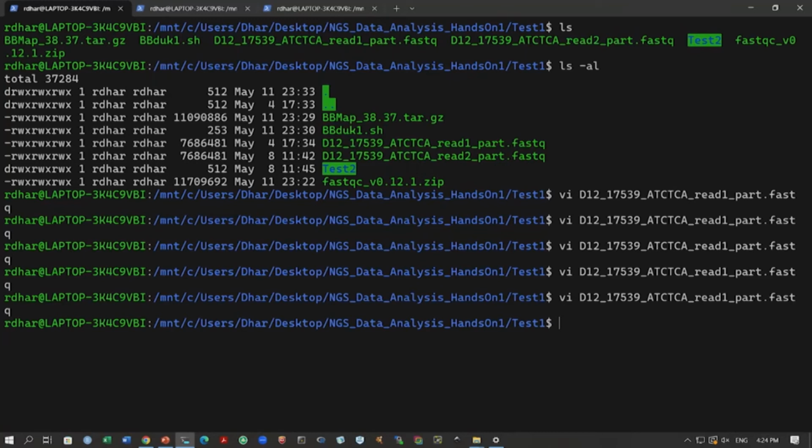So, that gives you a brief overview. Now the next agenda is to look at the quality of these FASTQ files. To do that, we have the steps that we have talked about. The first is setting up FastQC. We will download and set up FastQC, and then we will run FastQC. We will generate the quality data, and it will give us some idea about the quality of these data sets. So, let us start with that now.